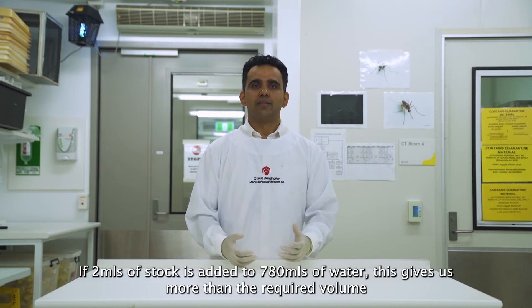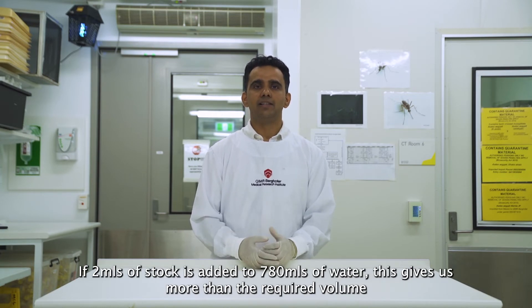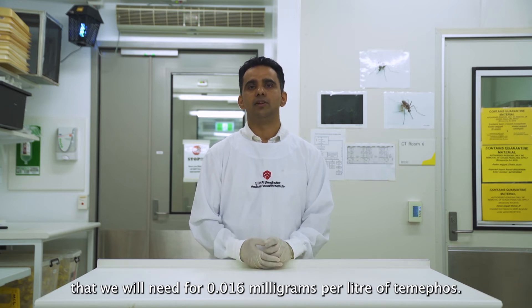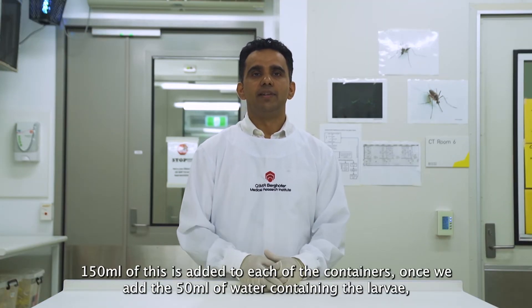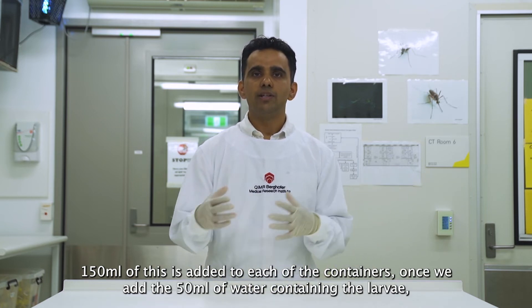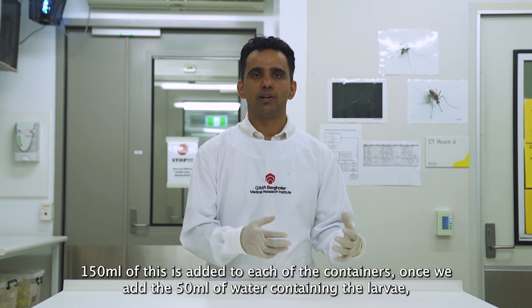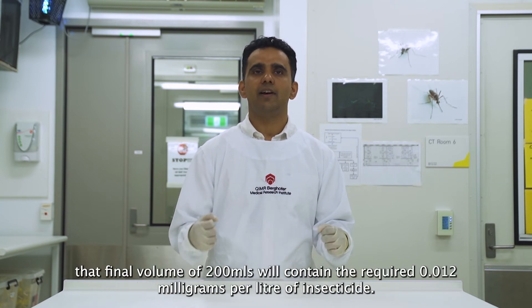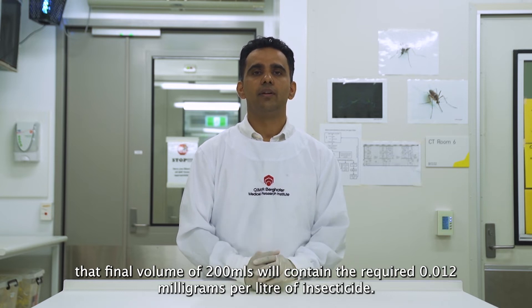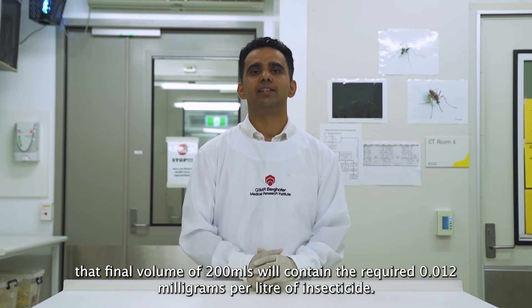If 2 ml of stock is added to 780 ml of water, this gives us more than the required volume that we will need for the four containers of 0.016 mg per litre of Temephos. 150 ml of this is added to each treatment container. Once we add the 50 ml of water containing the larvae, that final volume of 200 ml will contain the required 0.012 mg per litre insecticide.